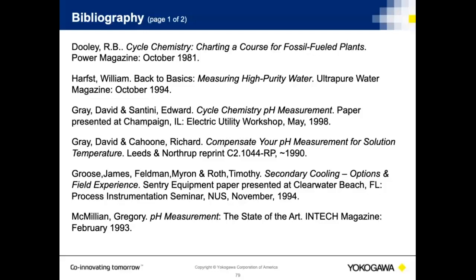Number 4 is, why aren't ISFET non-glass electrodes more popular? Why are they more popular? Why aren't they more popular?